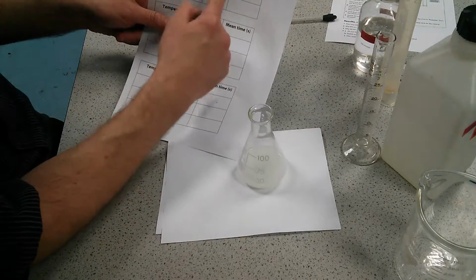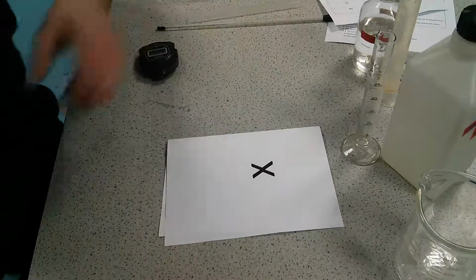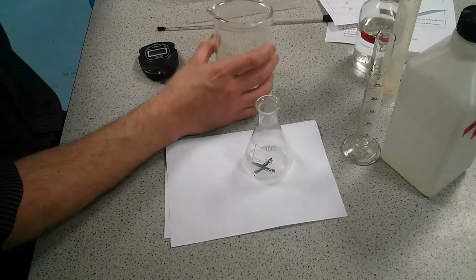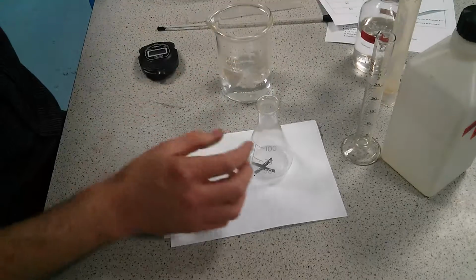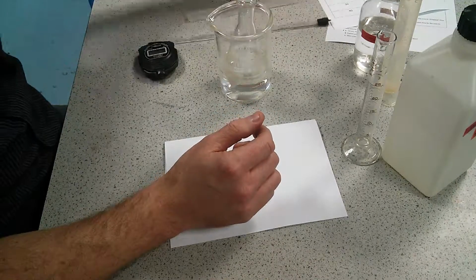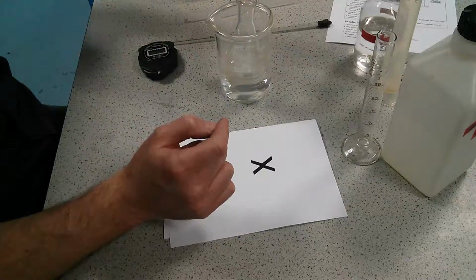We'll do it for a second time. And then we're going to repeat the practical with fresh equipment. So this time what we're going to do with sodium thiosulfate is you put some hot water into a beaker. Right. Measure your sodium thiosulfate at 25 mil. Put it into there and you're trying to get it as close to 30 degrees centigrade as you can.